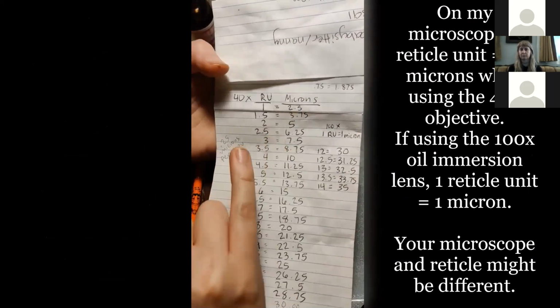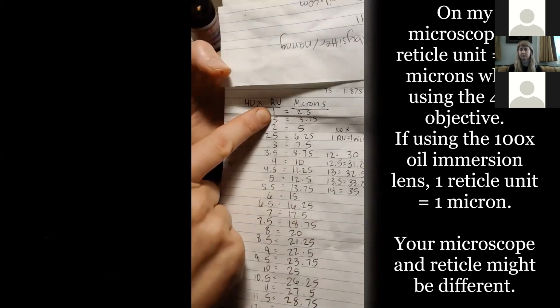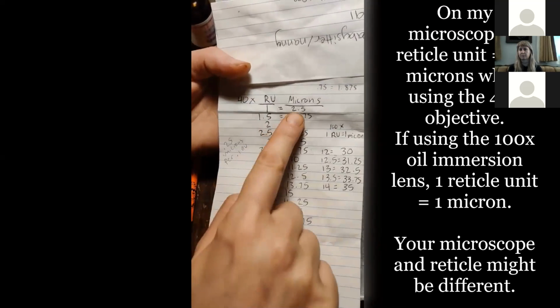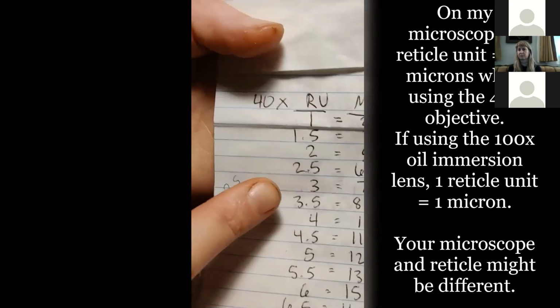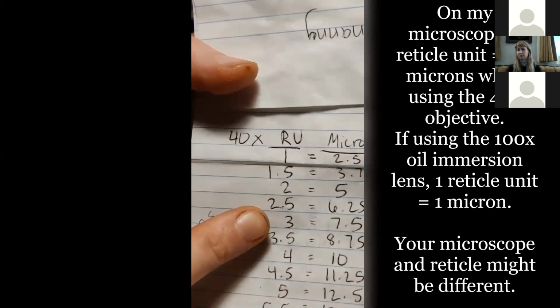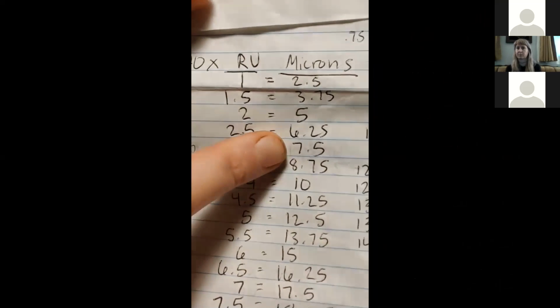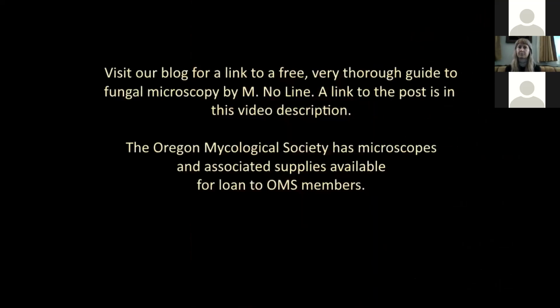That's a measurement. So for every 1 unit that I'm looking at through the eyepiece, it's going to be 2.5 microns. So if I find something and the spore is 3 reticle units long, then it's actually 7.5 microns in real life. So that is how you would measure the spores. Hopefully that's helpful to people.